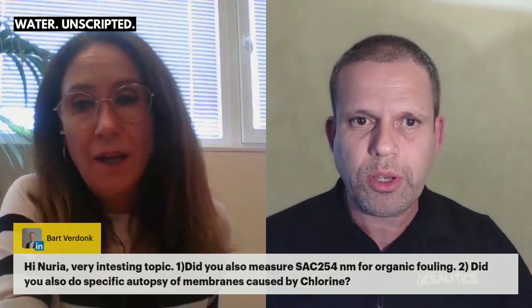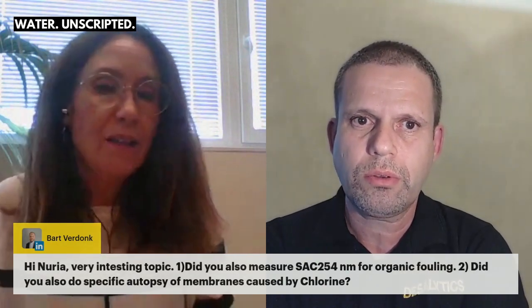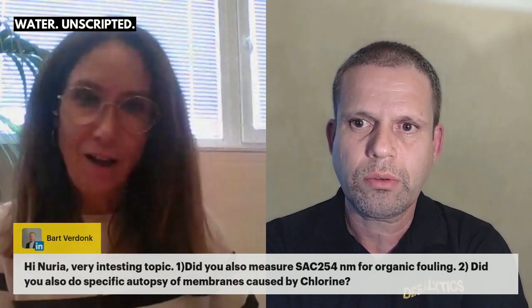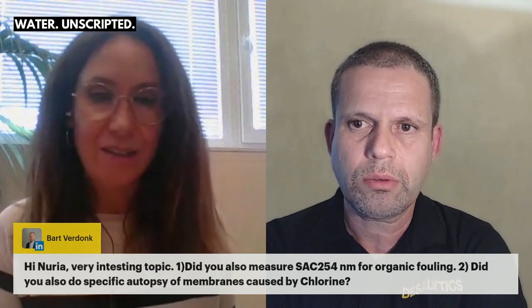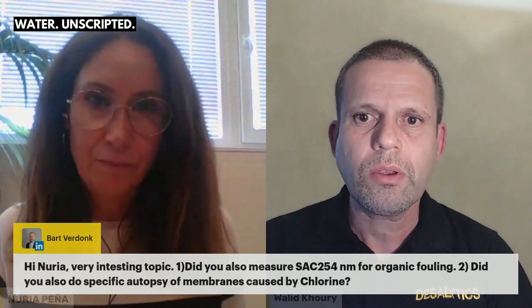How many days, process-wise? It depends on the objective of the autopsy. To have an identification of the foulant will be two weeks, for example. To have a full autopsy, checking integrity, cleaning tests, etc., it commonly takes four weeks. It depends also on the hurry. We always try to adapt to the needs of the customer. If there is a real hurry, a real problem, in some cases a very important meeting, we try to adapt our delivery time to that. But if not, it takes time because you need certain information before you make cleaning tests.